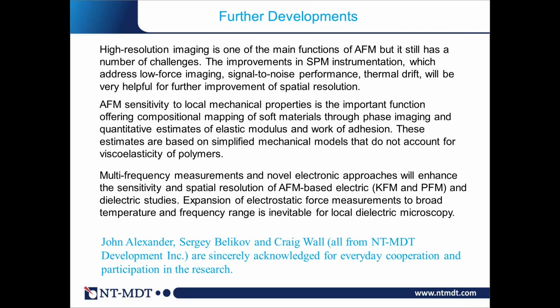And there is no good liquid cell developed so far. There are efforts through magnetic drive, there are efforts through electric drive, but truly speaking, routine measurements are very, very difficult. Therefore, we need to have a lot of skills to do that. And that's a challenge. That's an outstanding problem. For 20 years, people haven't solved that. I don't know what even to say in this respect.